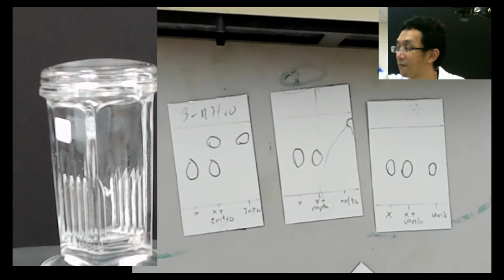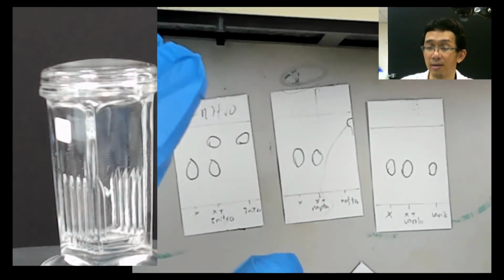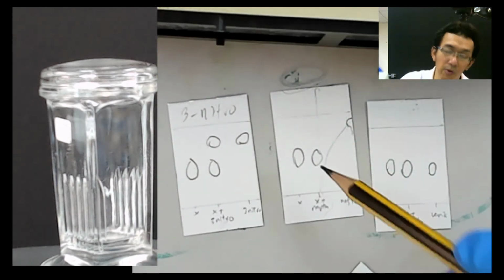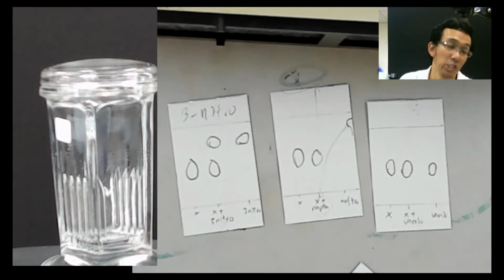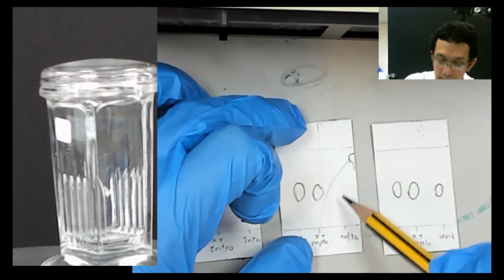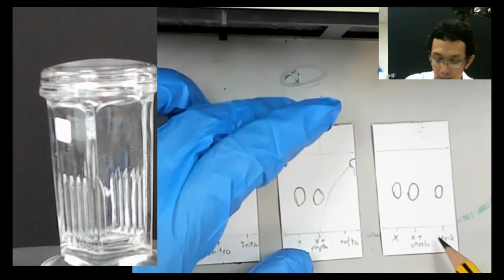So that's why we try to mix here and there to find the best, the optimum solvent, so that the spot is in between. Because only when the spot is in between, you can calculate the RF. So that's the idea. You have different solvent combinations. And how to find that? That is like trial and error. You need to find this plus this plus this and so on. So this is what we call bleeding. Maybe naphthalene goes that way.